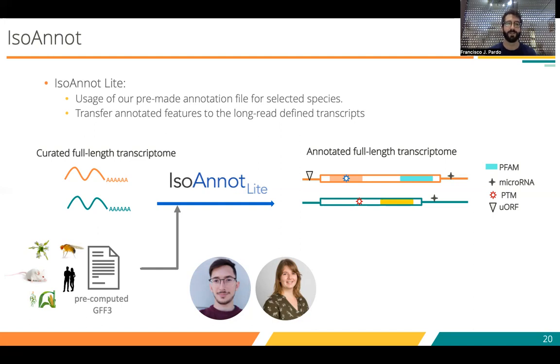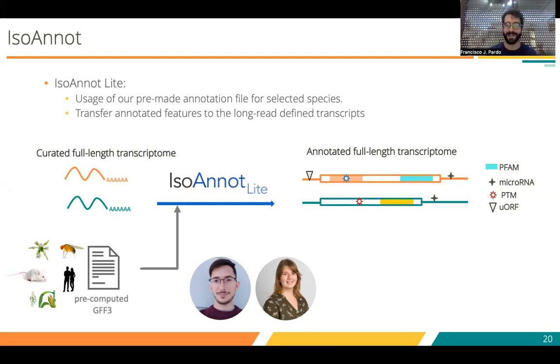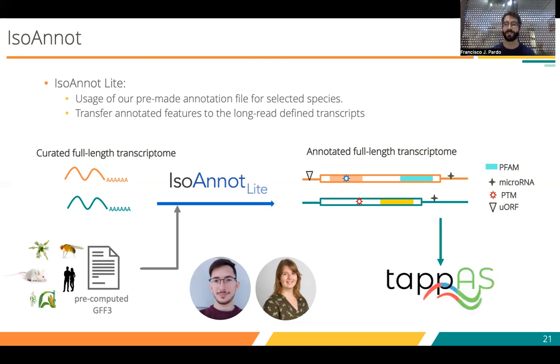Right now, IsoAnnot is not fully working because it's really tedious to run with all the different things that each annotation and database have. What we have is a bypass called IsoAnnot Lite, in which we have a bunch of pre-computed GFF3 files — for example, for human, Drosophila, or mouse. We have the annotation at the reference and isoform level, and we can transfer those annotated features into the curated long-read-based transcriptome. After running this and getting the fully annotated transcriptome, we can go into TAPAS.